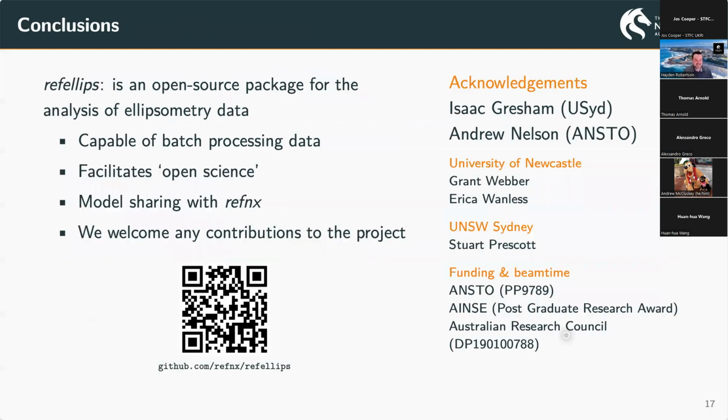Okay, so thank you everyone for listening. I hope that I've inspired you to think of different ways that you might be able to use Refellips, whether that's its batch processing ability, or its being conducive to reproducible research, or even using it to inform your reflectometry experiments. I hope that you find a use for it.